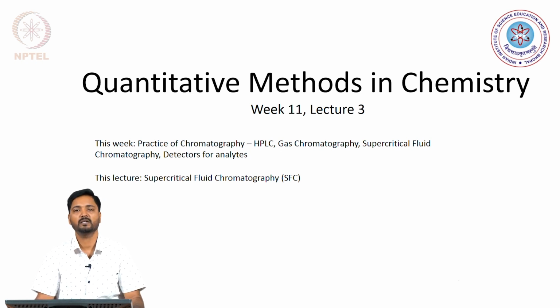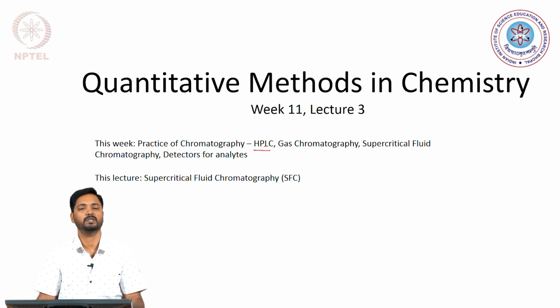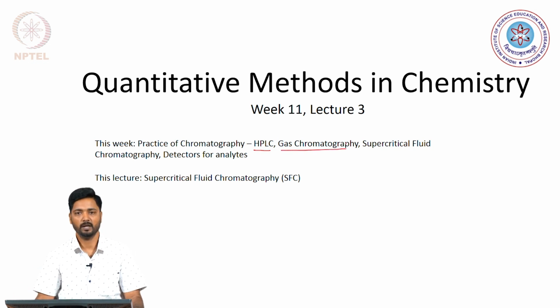So, this week our focus has been on developing a clear understanding of how practice of chromatography is undertaken. We have already got to know about the practical considerations with regards to high performance liquid chromatography. We also got introduced to gas liquid partition chromatography, which is colloquially abbreviated as gas chromatography.